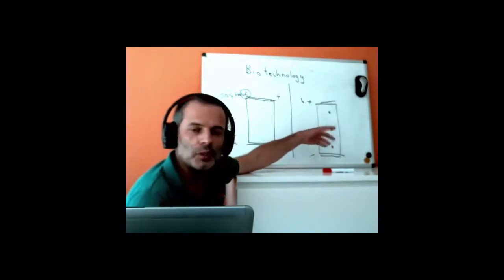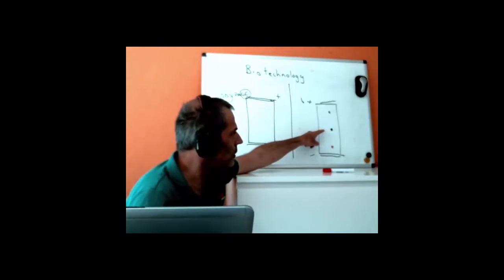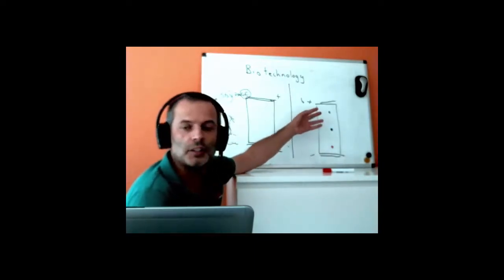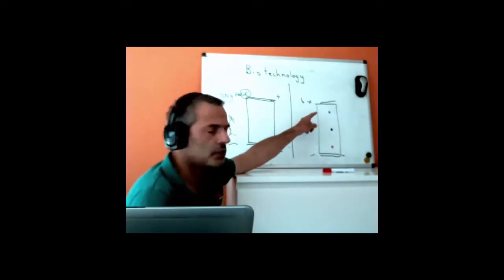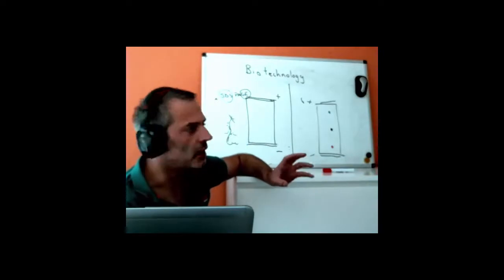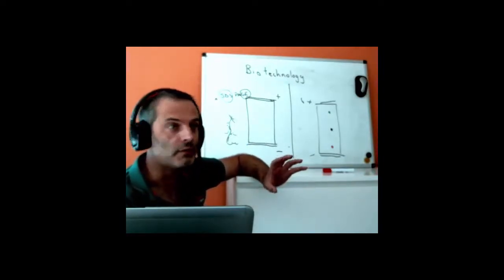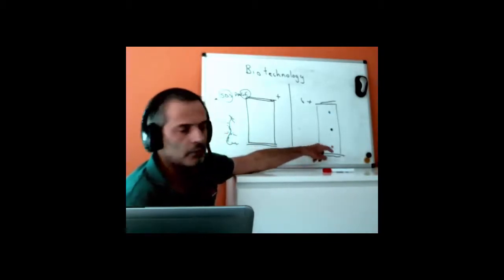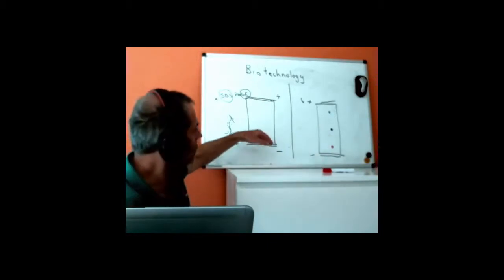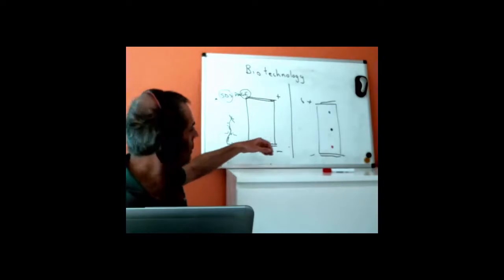Up in the middle the same happens, so our other protein that has a different point of zero charge will become stuck here, and the protein that has an acidic point of zero charge is stuck up here, the green one. That's brilliant. It has lots of advantages. Major advantage is that we can wait for longer because the protein can't escape. If we do the other electrophoresis, if we forget, then it goes too far and the measurement is ruined. There's nothing you can do to get it back, or not very easily.